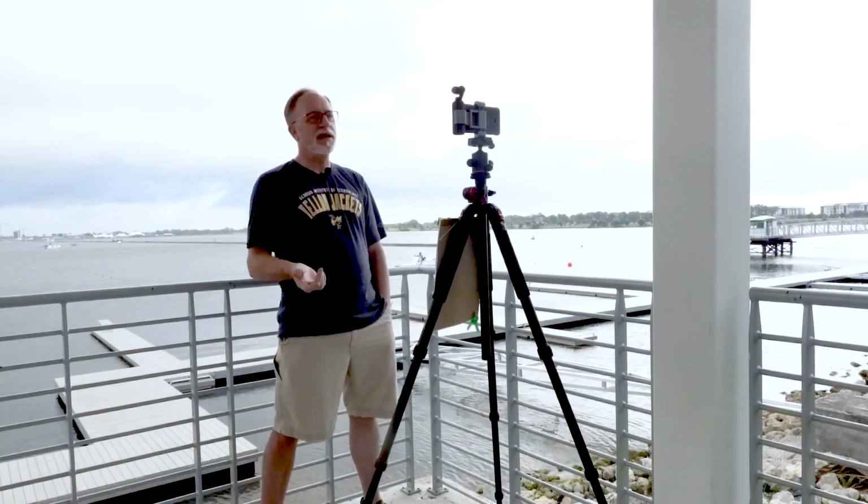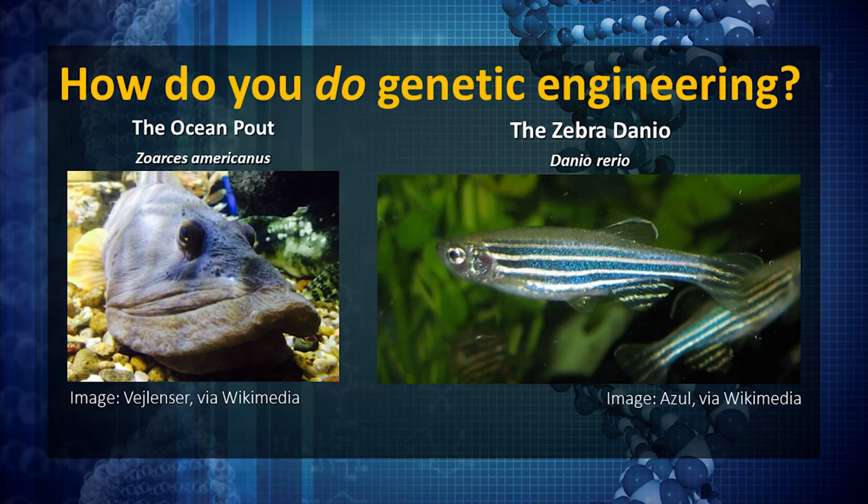Well, more amazing technology. First of all, we need something that the fish are going to express. Not a bacterial plasmid, we need a fish plasmid, or a circular piece of DNA that has something in it that's going to turn a gene on in a fish. And for that, we use what was called the ocean pout antifreeze protein promoter. The ocean pout is a fish that's famous for not being able to freeze. It produces a massive amount of these short little proteins that we call antifreeze proteins, and it fills their blood with them, and they prevent ice crystals from forming. So the fish can't freeze, at least even at very cold temperatures. It probably can freeze eventually, but not under icy conditions.